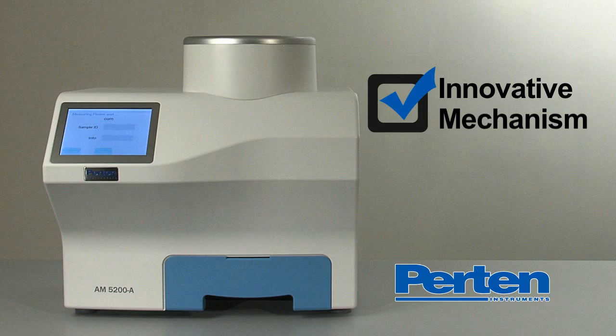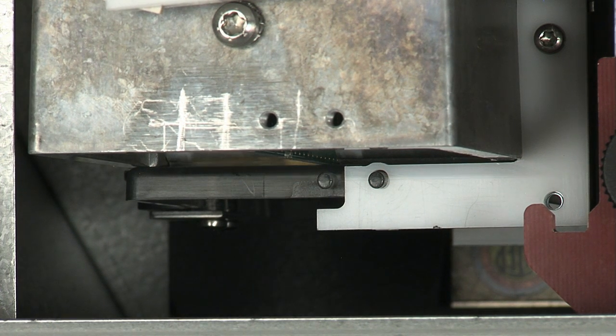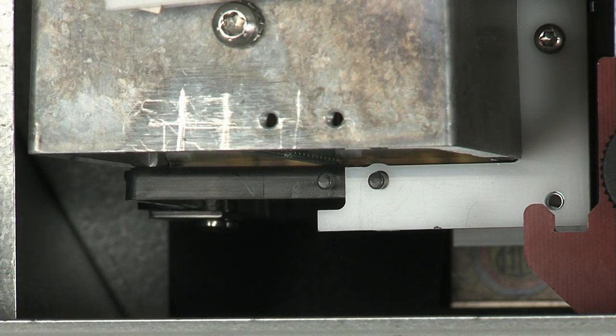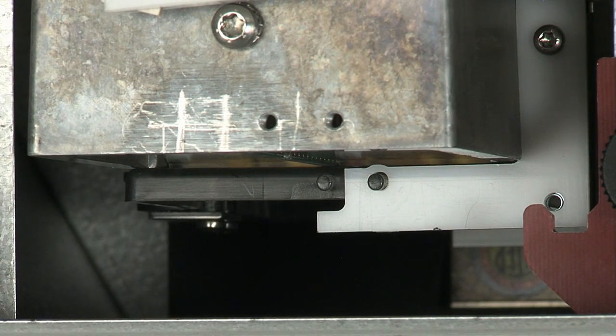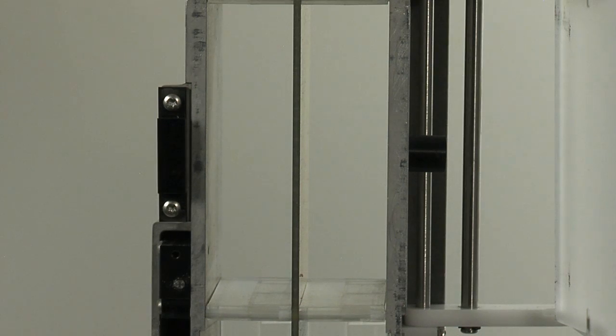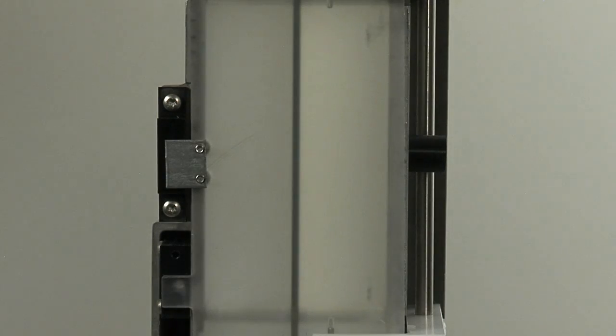The Purtin AM5200A is a good housekeeper. Its interior design prevents dust buildup at critical points, such as at the bottom of the collection cell. The snap-action shakes free any dust buildup, ensuring constant weight and volume accuracy over long periods of time.